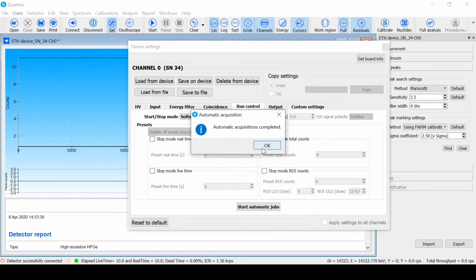Press OK when all the acquisitions have been completed.